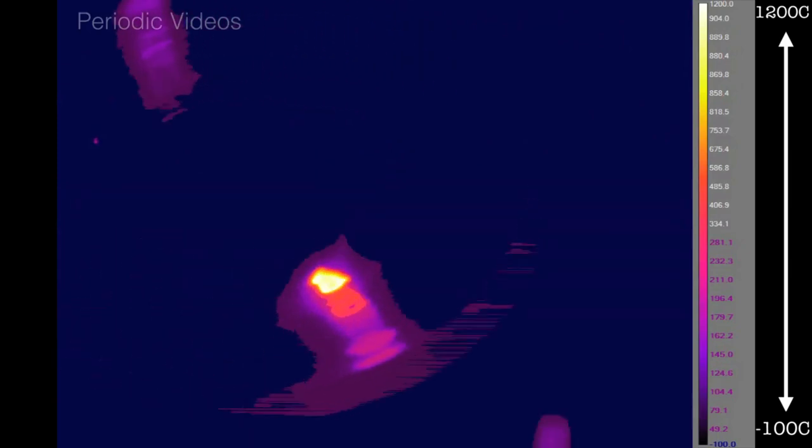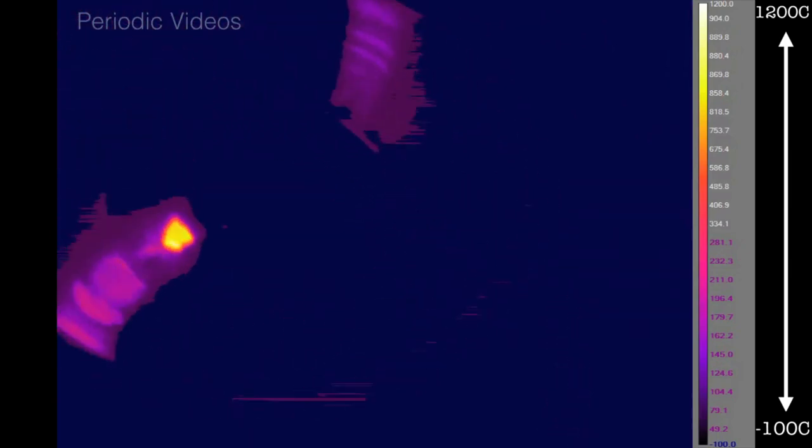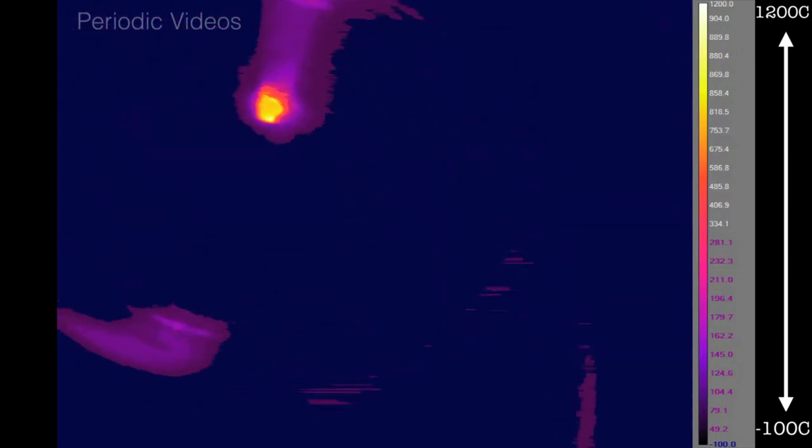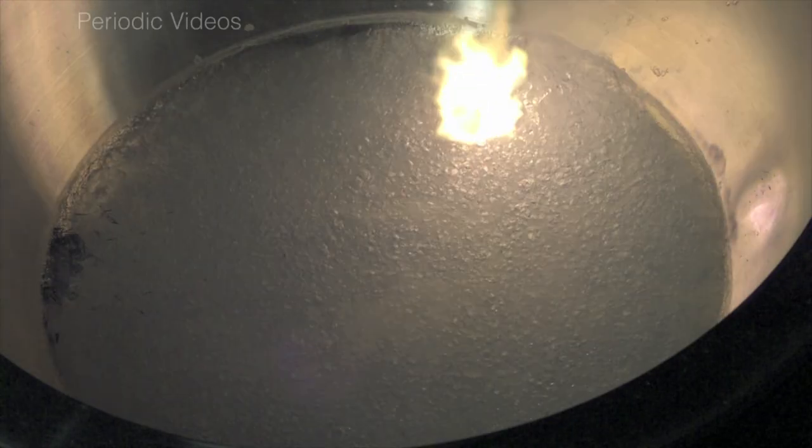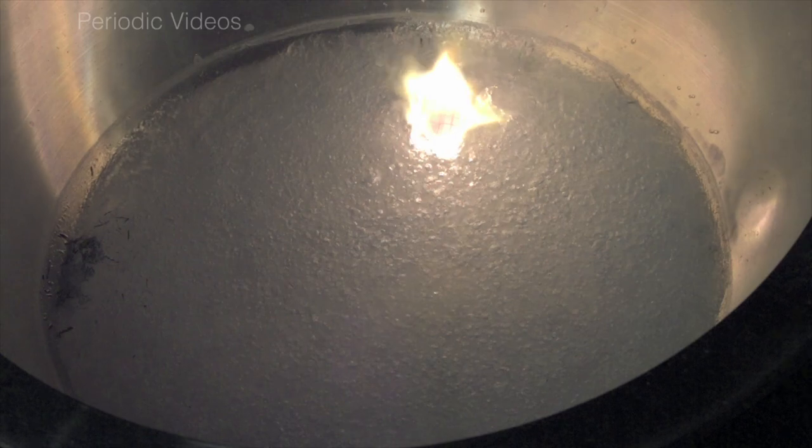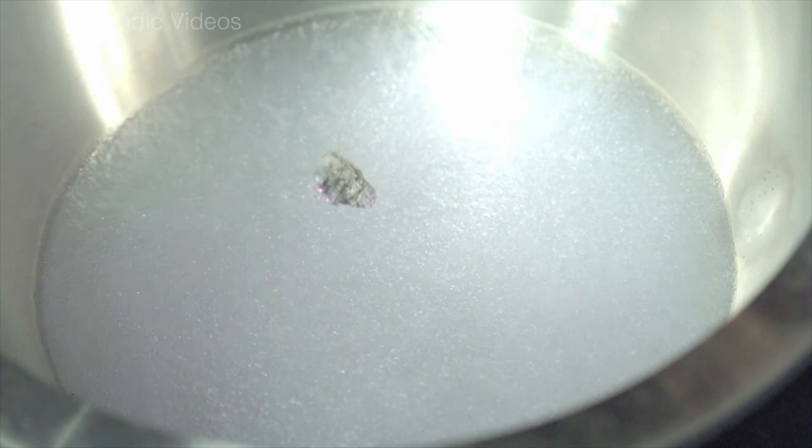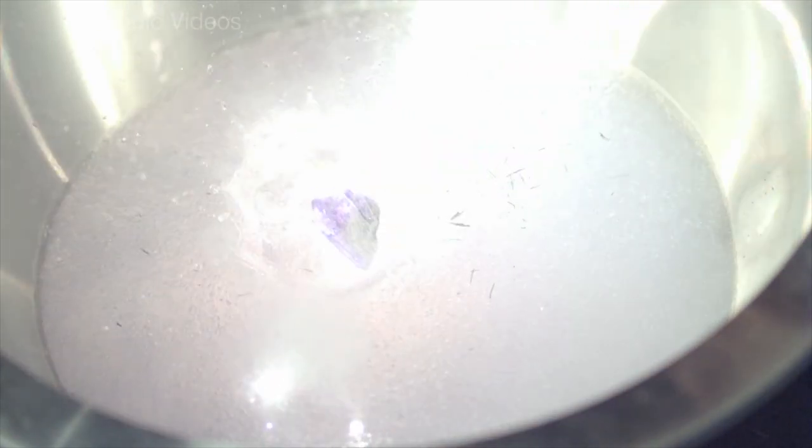Now, you can't see that hot gas, because it's probably not radiating in the same way as the charcoal. But you do need to remember, you can't have a liquid at minus nearly 200 degrees centigrade in contact with the surface that's at 1000 degrees centigrade.